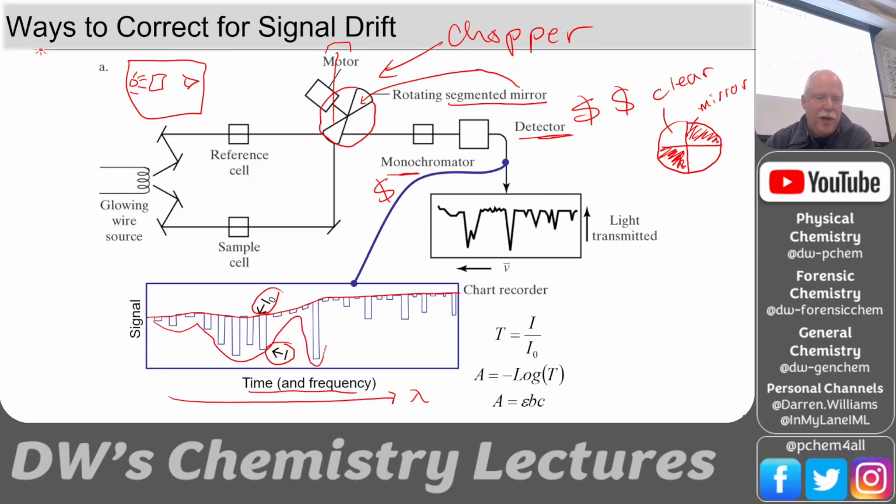This might be a sharp peak, okay, and then some smaller peaks like this. So that's your spectrum. And then this chopper, because the source is drifting, okay, all of that is set to 100%, and so then you get a nice clean spectrum with this flat baseline at 100%, or a transmittance of 1. So that's a way to correct for signal drift.